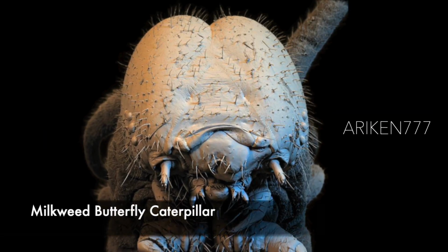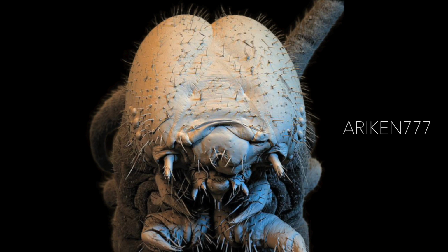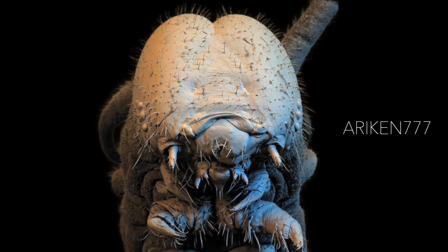A milkweed butterfly caterpillar. This image shows the underside of the larva of a milkweed butterfly, showing its mouth parts in lower center and forelegs at bottom center.